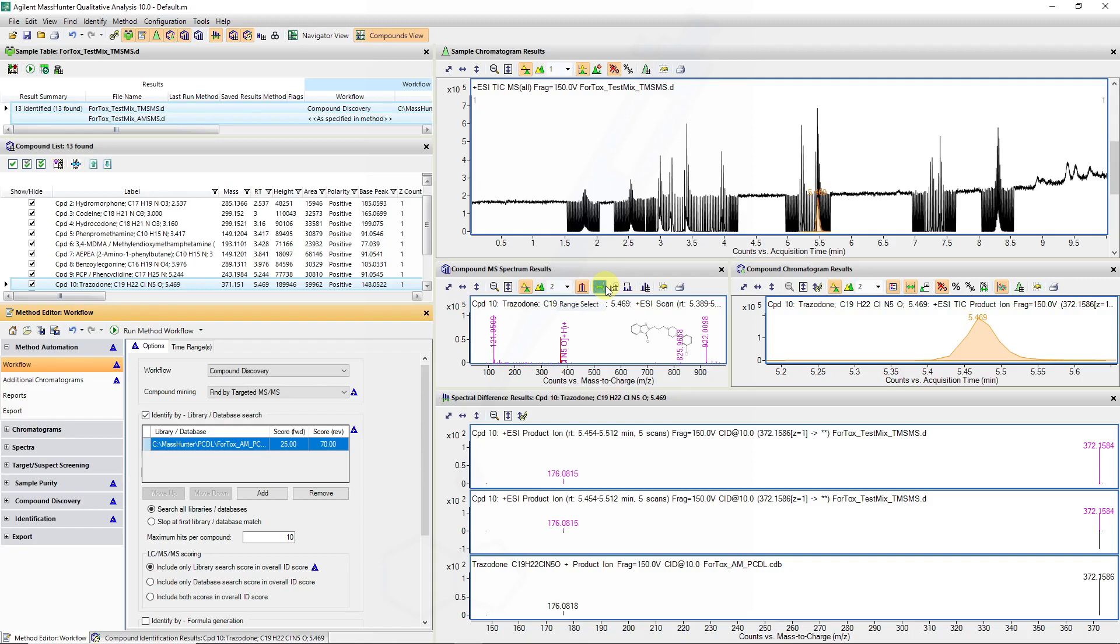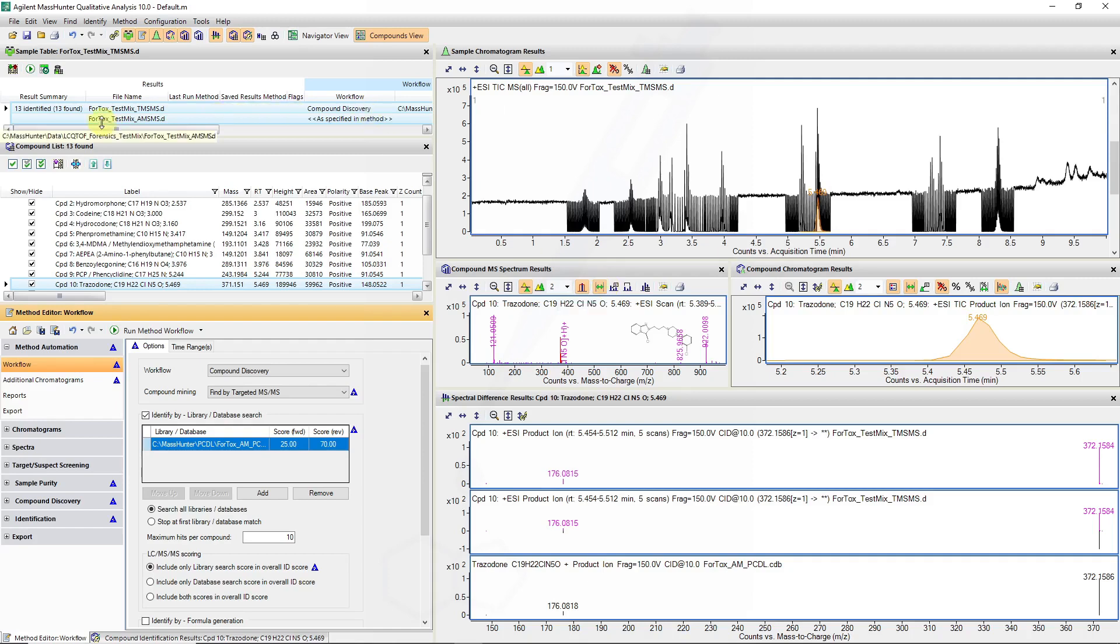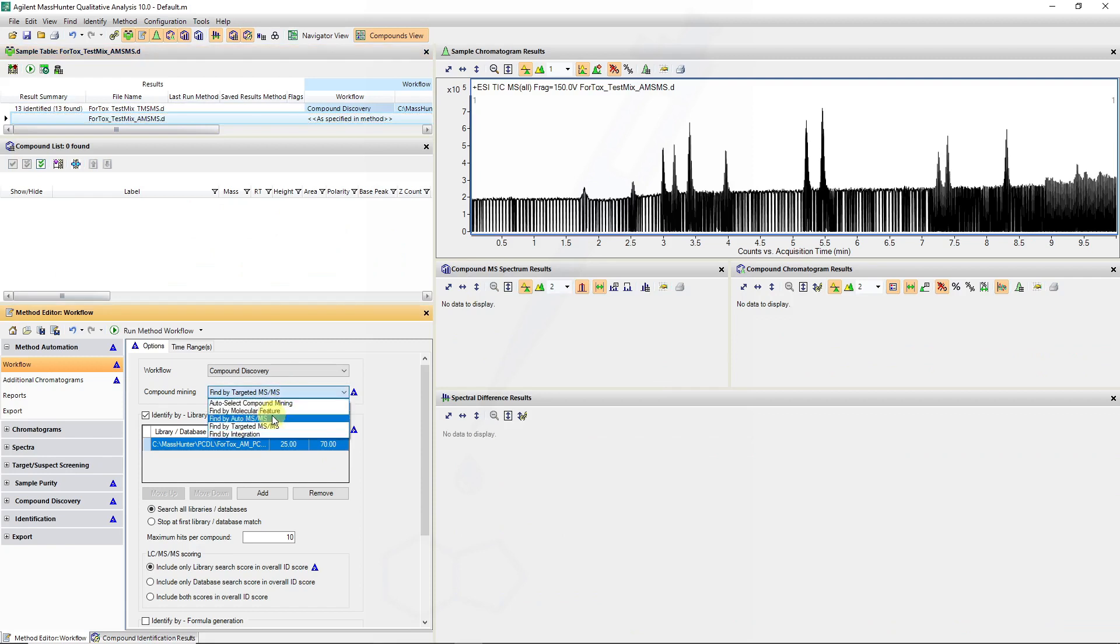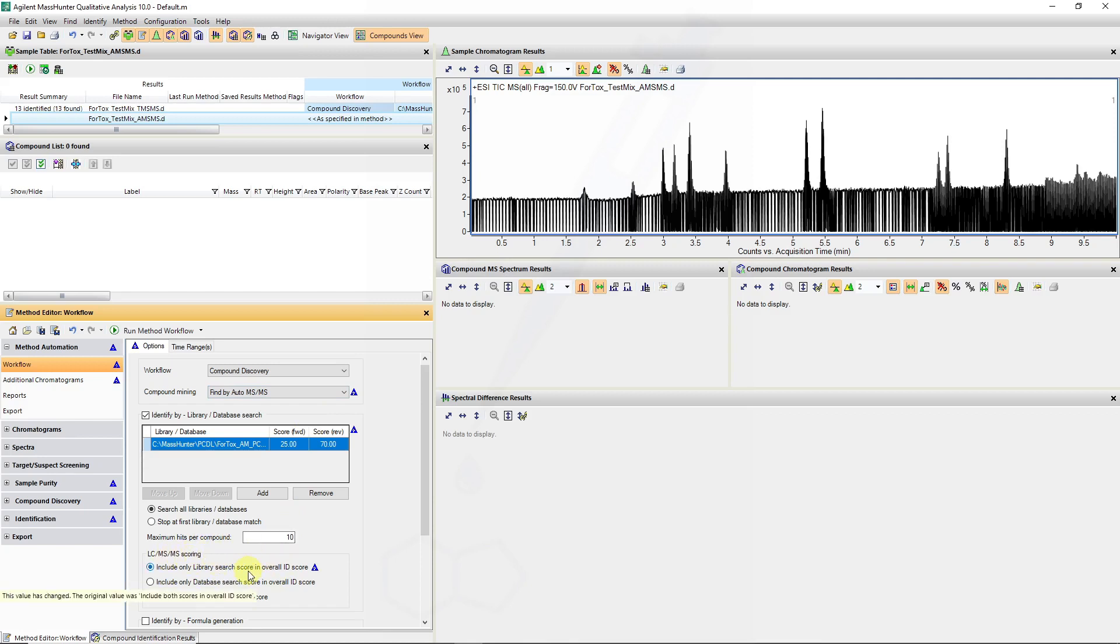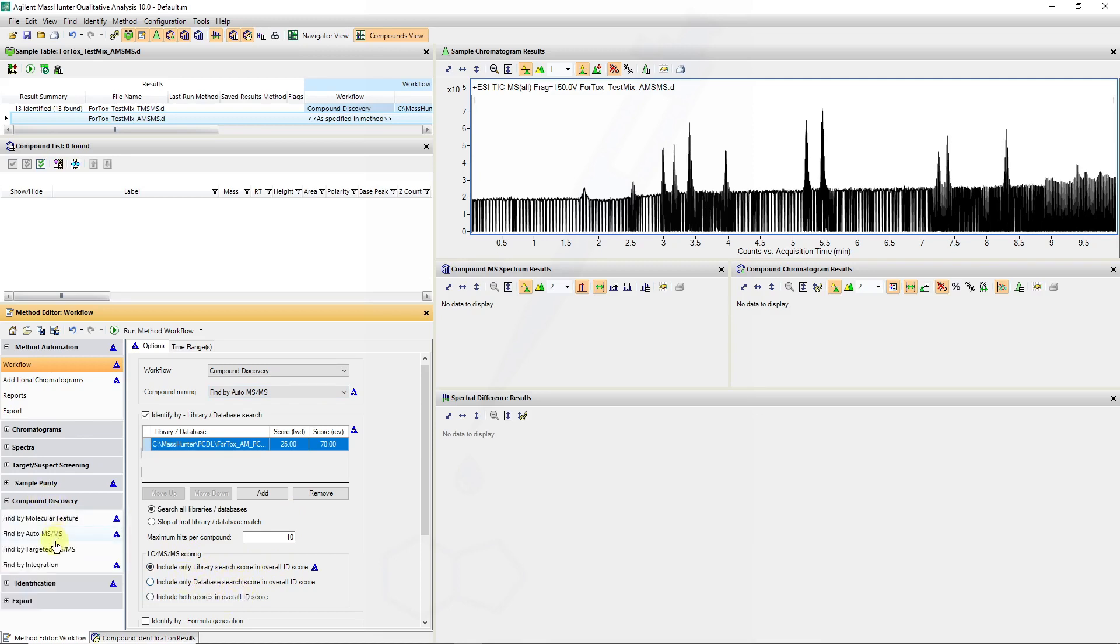So we can very similarly run through a compound discovery workflow. This time we change to the auto-MS-MS mining algorithm. In this case we're also waiting for the library searching in the overall score rather than the database search which also encompasses a formula search. And in compound discovery we can now look at some of the find by auto-MS-MS parameters. In this case some retention time windows and similar TIC thresholds can be set.